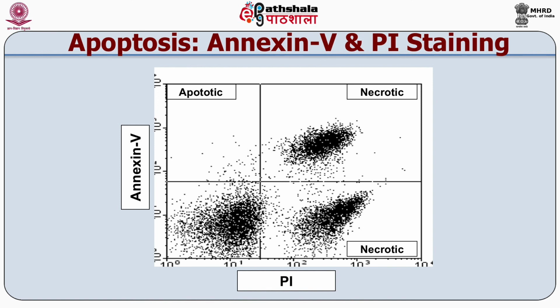The loss of integrity of the plasma membrane can be evaluated by flow cytometry either using dyes such as propidium iodide, which are excluded by an intact membrane, or using fluorescent dyes which are retained in the cell only if the membrane is intact. In this example shown, the dead cells in the lower right quadrant of the dot plot are propidium iodide or PI positive.